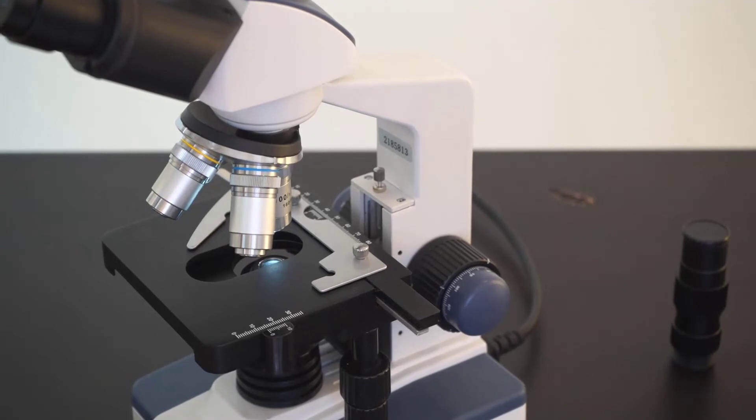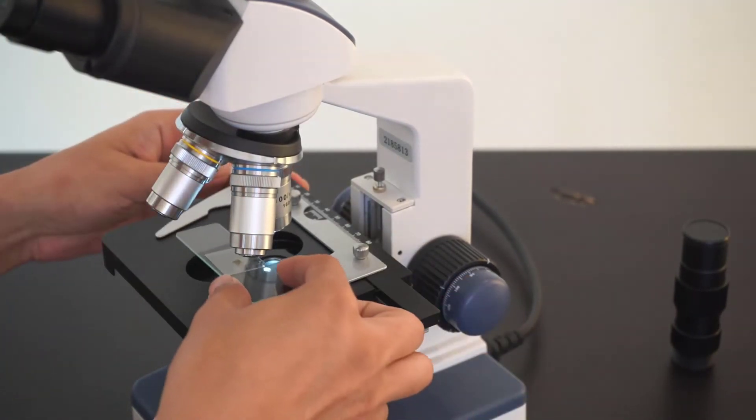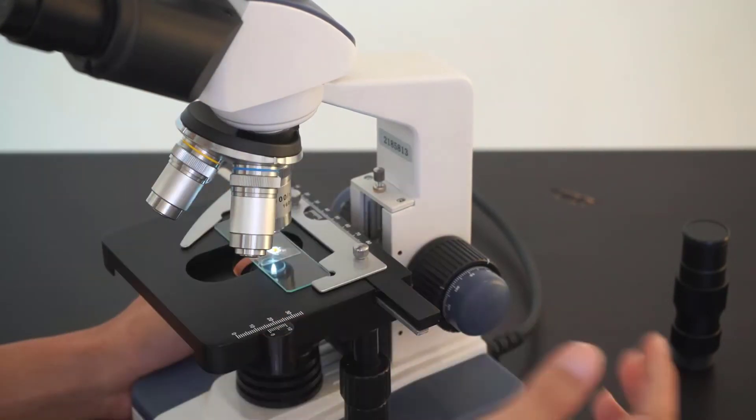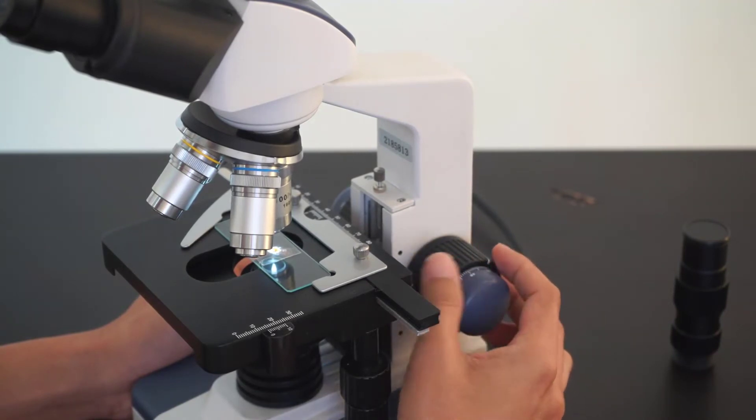To use the microscope, we have a slide over here. We just insert the slide into the stage of the microscope, and we can use two knobs to adjust the focusing of the microscope.